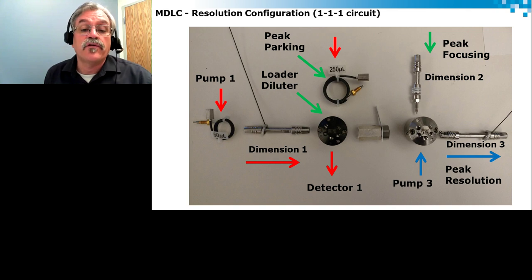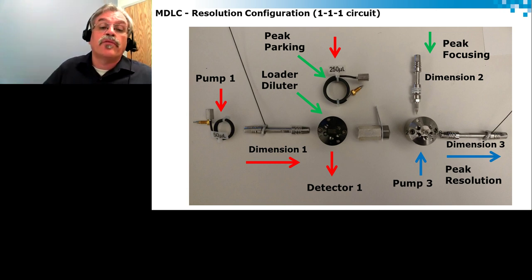We can have a scenario where we're looking at, let's say, an HPLC high flow rate UV, and we can go towards a UPLC MS, for example. So that means that we can get a validated method in HPLC and get MS data without having to change the method.